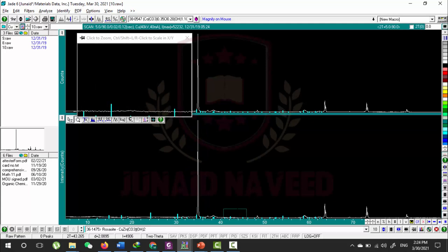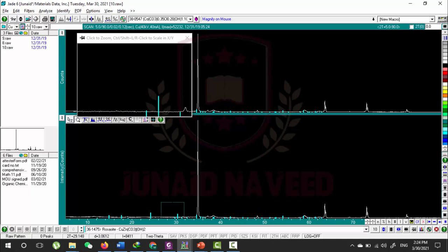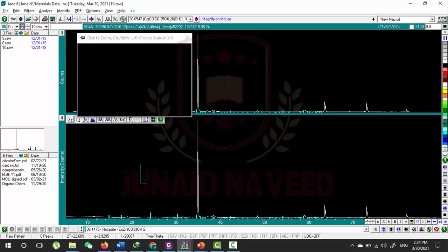The second button is the zoom window. As you can see, we can see any portion in the smaller zoom window.